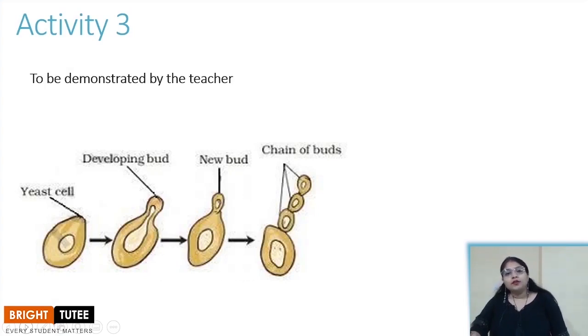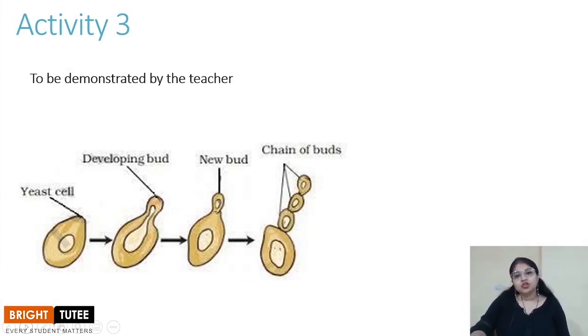You might be thinking that reproduction might take time, but when yeast finds proper nutrients and proper temperature, that is, a friendly environment, it multiplies quite easily and grows quite quickly. So we are going to perform an activity to understand reproduction by the yeast.